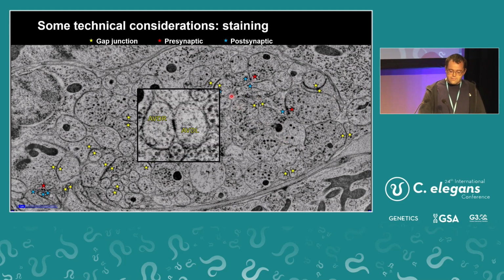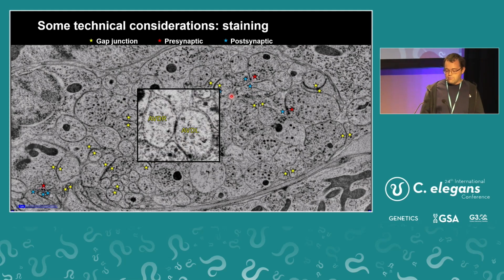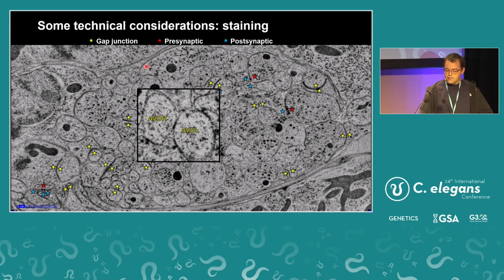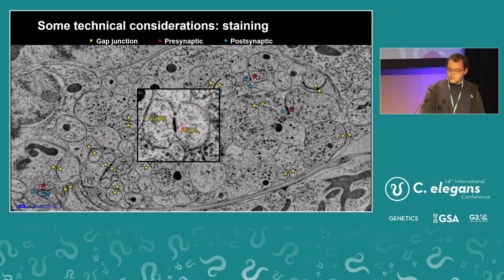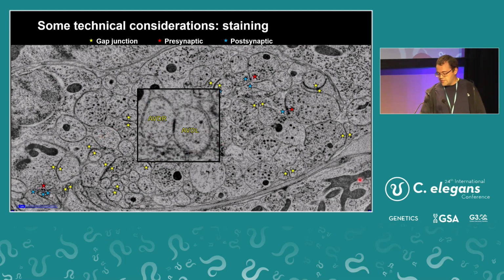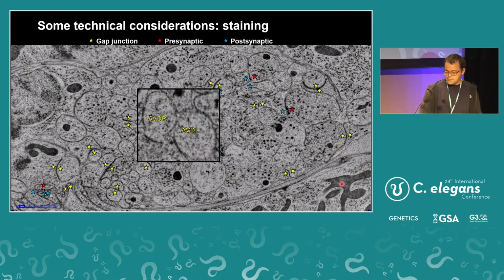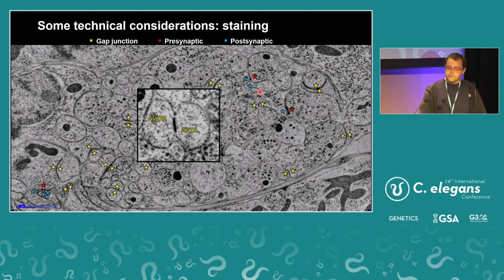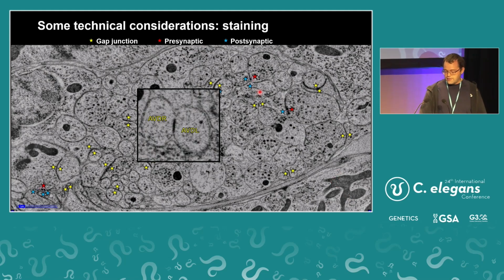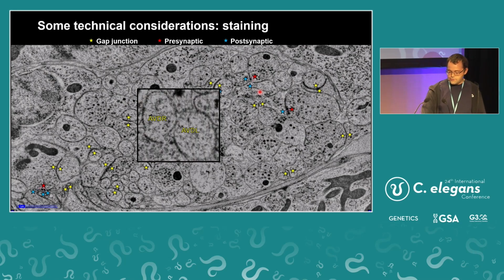So this means that with this staining we can go through our volume and get quite a high confidence readout of connectivity. But this staining condition isn't so good for someone who's interested in mitochondria, for example, because you can't really see the mitochondrial cristae very well. So in that case, you just use a different protocol that was optimized to highlight those kind of features.